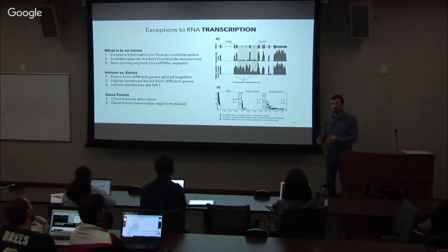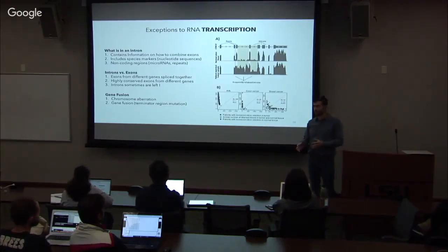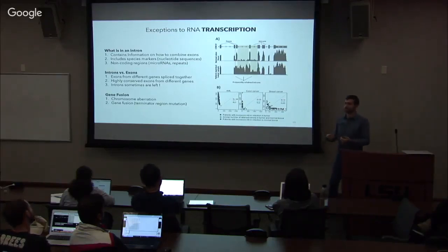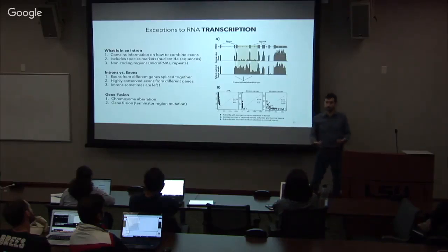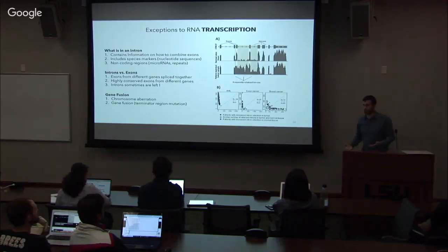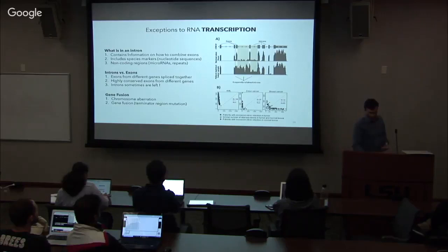And so if we're interested in those types of changes, we should probably avoid mapping on transcripts and focus on mapping on the full genome, and then looking at what types of variations do we see, what kinds of gene fusion do we see, what kinds of differences in alternative splicing, and how do we evaluate even expression of introns and not just exons. And then the interpretation, of course, becomes much more complex because all of our database-driven interpretation is going to be focused back on transcripts and known events that have been documented.